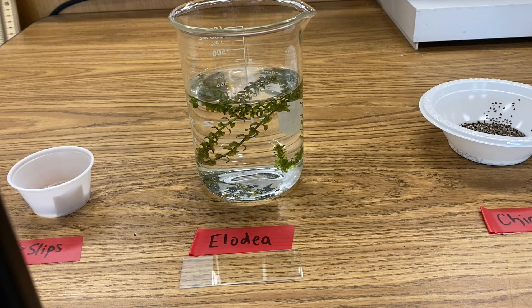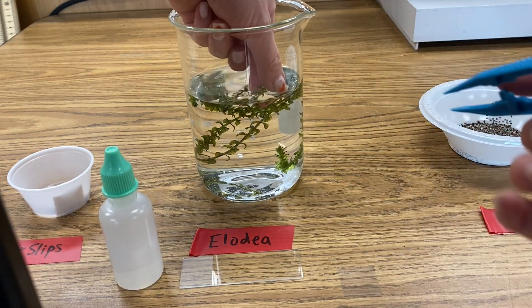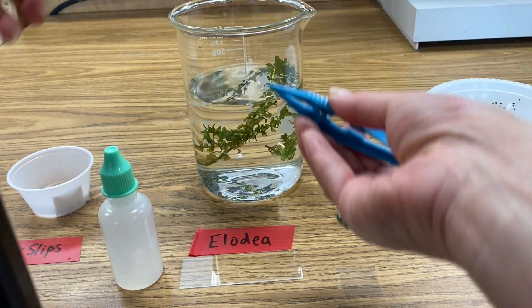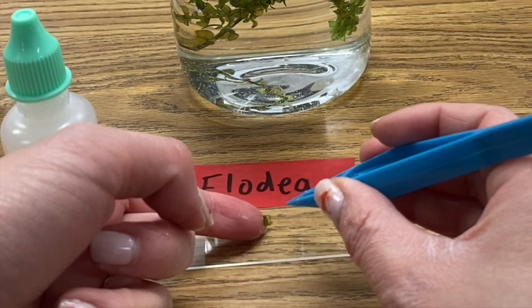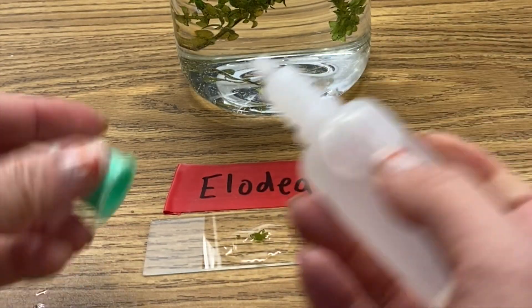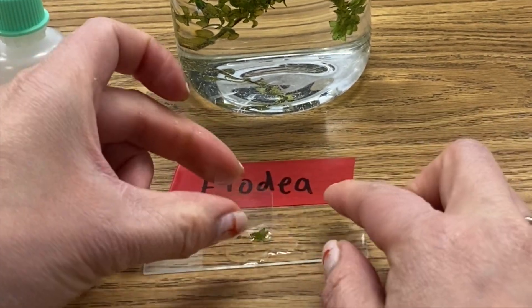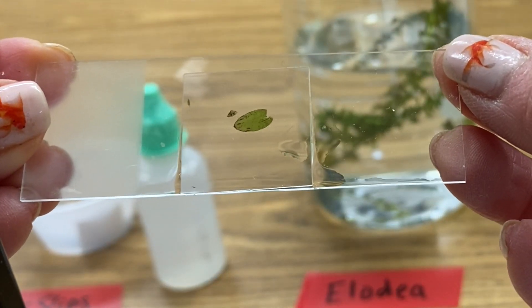To prepare your slide of the Elodea plant, first take one Elodea leaf off of the plant. You can do this by plucking it off with your fingers or you could use a pair of tweezers. Go ahead and set the leaf so it is flat on your slide. Next, put two drops of water on it to make it a wet mount, and go ahead and drop on your cover slip. Now your slide is ready to be viewed under the microscope.